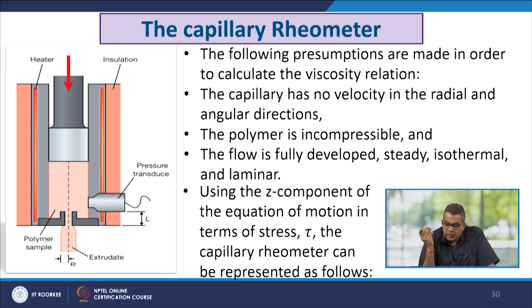There are certain presumptions that are made in order to calculate the viscosity relation. The capillary has no velocity in the radial and angular direction. The polymer is incompressible and the flow is fully developed, steady, isothermal and laminar.